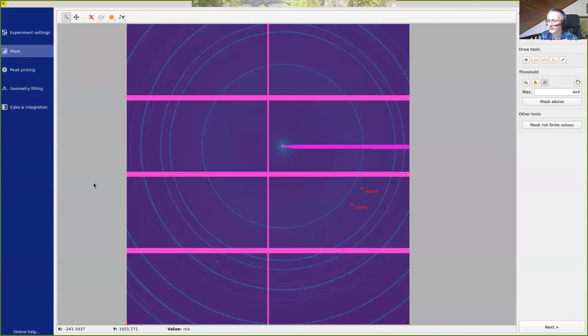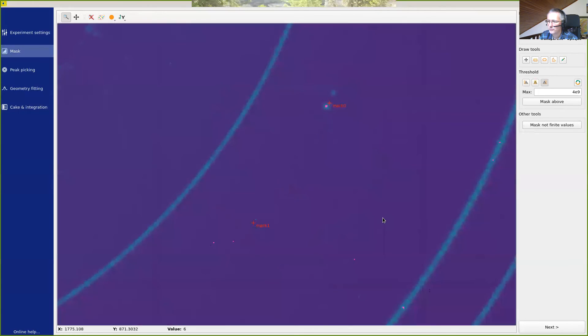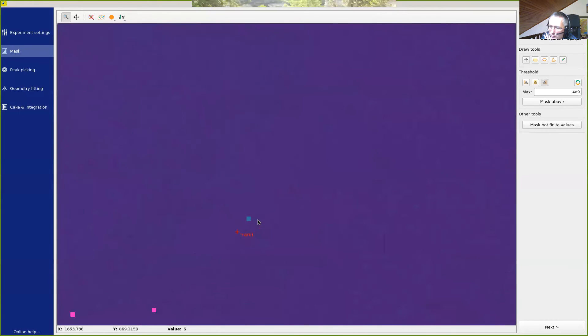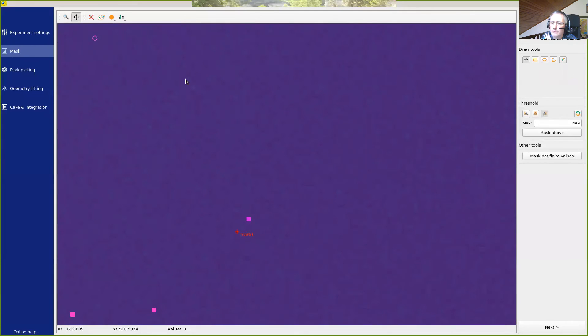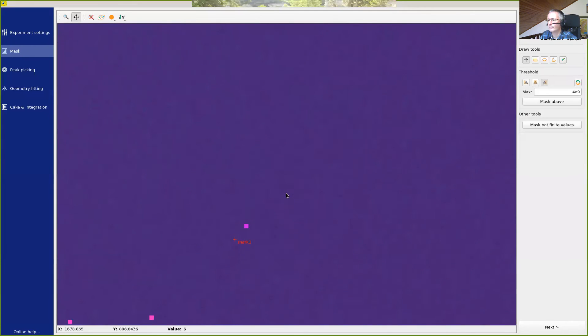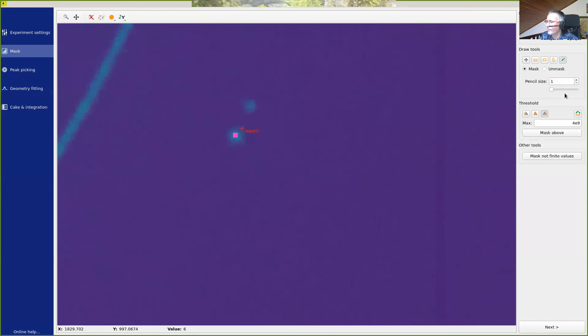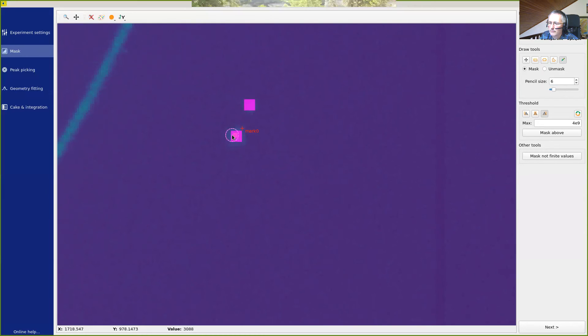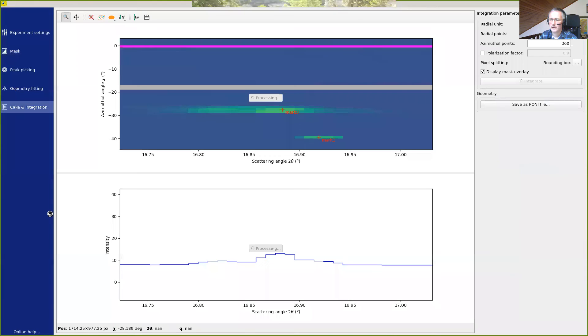And then go back to the mask region. If we zoom at this position, we can see that we have some regions with high intensity that we wish to mask using the pencil tool. Like this. And once this is done, we have masked out those regions. And if we go back to the cake integration, we can see that those pixels have disappeared.